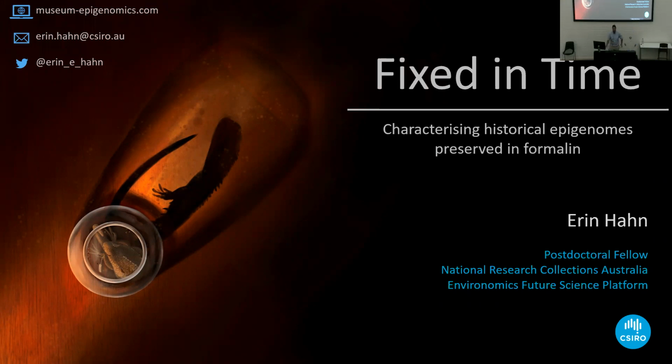It is my pleasure to introduce Dr. Erin. She will be giving us a quick seminar on a topic called Fixed in Time. She's a postdoctoral research fellow from CSIRO. Now with the really good stuff. Erin has an actual formula to go back in time. She developed these new methods wherein you can extract DNA from formalin fixed collections and specimens.